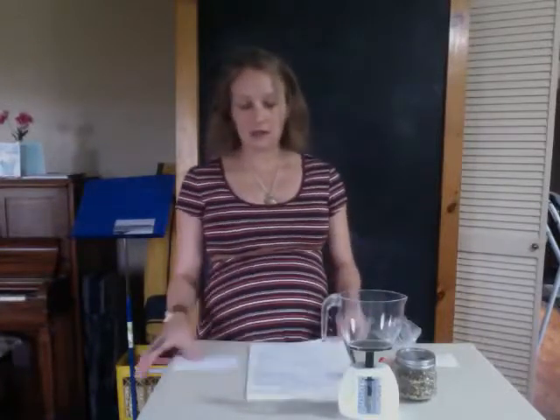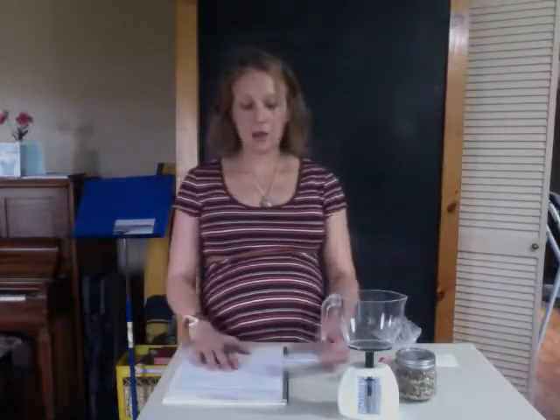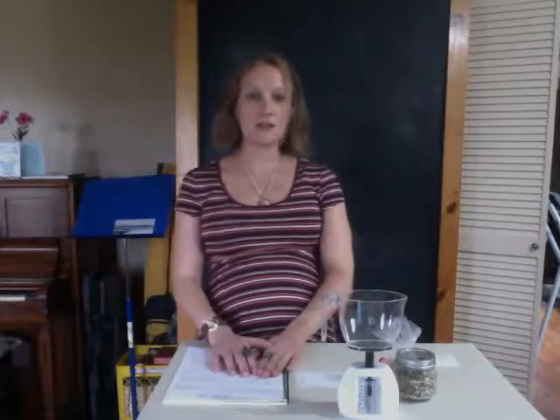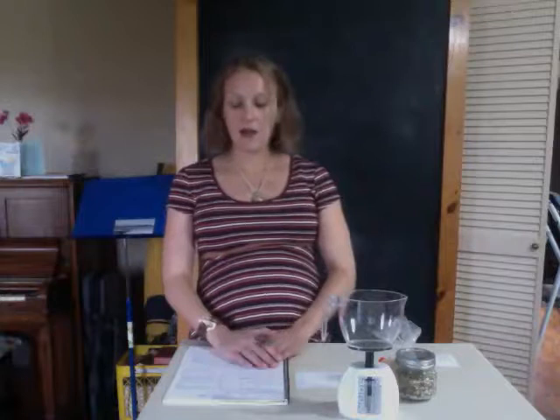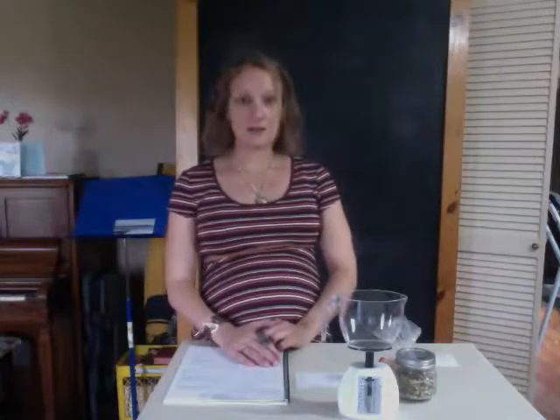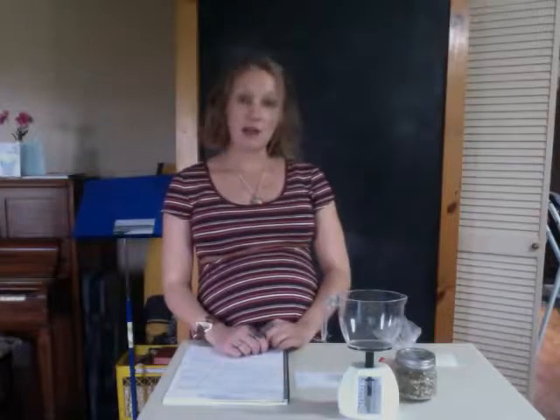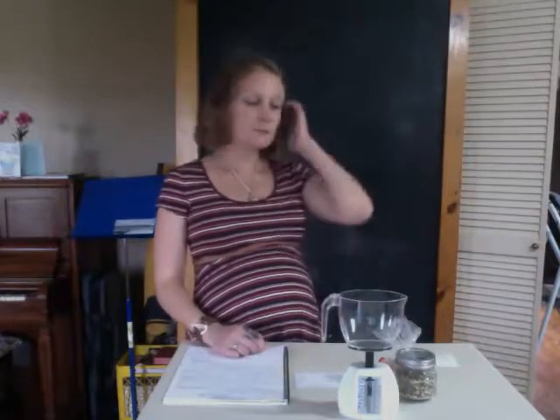When we do this in the laboratory, students weigh pennies. Pennies that were made before 1981 and after 1981, because the U.S. Treasury changed the material that they used to make the pennies out of. If you're able to find those samples, pennies from before 81 and after 81, you're welcome to do that as your experiment. That's a fun one.